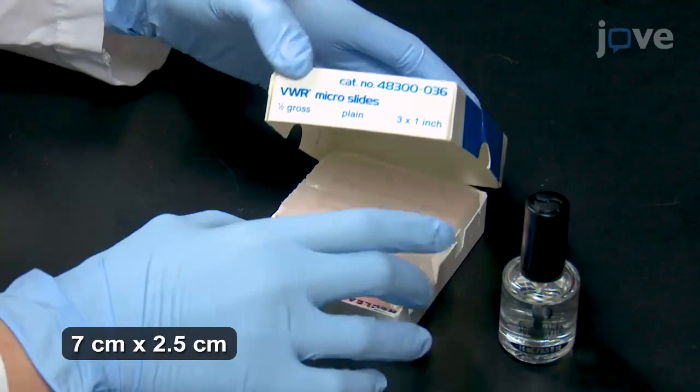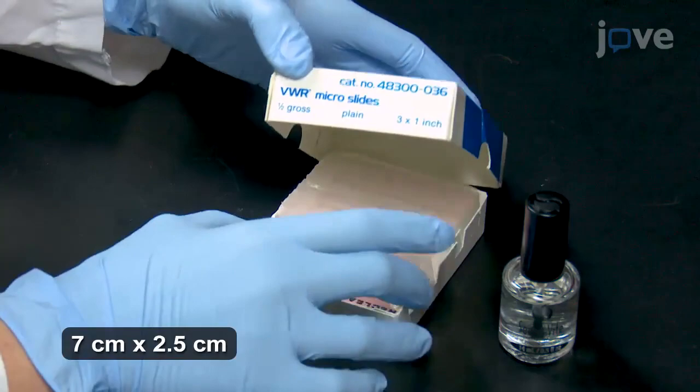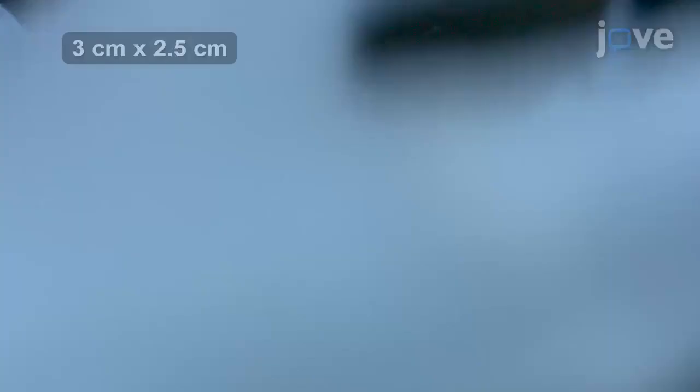For a slicing chamber, paint lines of nail polish onto a slide. Using clear nail polish, paint narrow lines to create a rectangle. Repaint the polish once when dry.